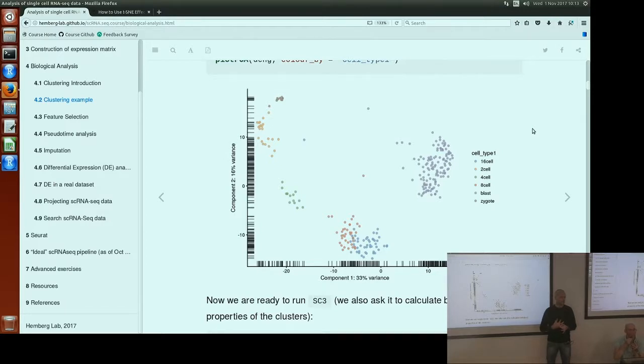And in general, I think it is the case that there are usually more than one good answer to the number of k, because depending on your view of the system and how fine-grained it should be, you can end up with two quite different choices of k, and it's all based on how you interpret it.